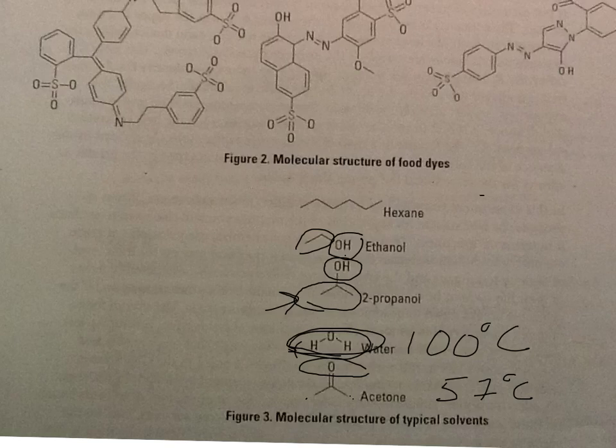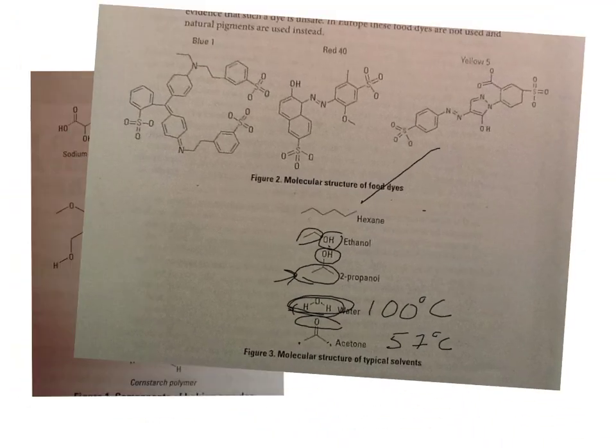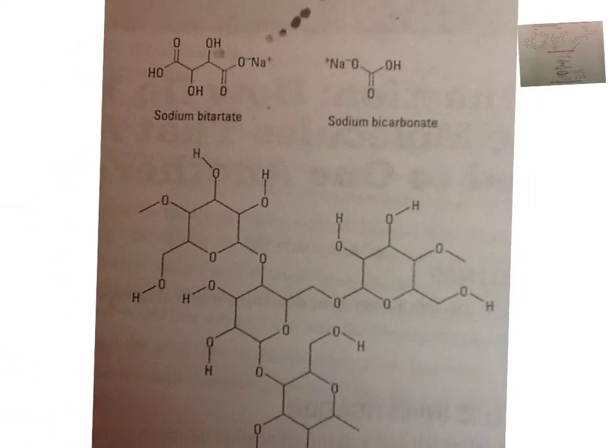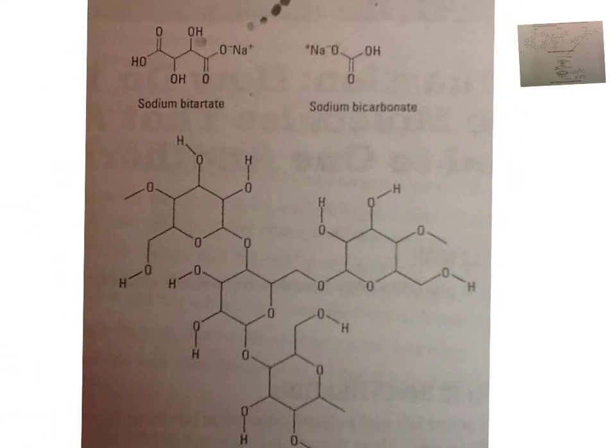Okay. Alright, so keep in mind that these are what these structures look like. And, whoops, let me get the other tool. Okay. So let me move this. Now, these were the structures that were in the pre-lab section, okay? So if you can imagine, water will work with any of these because it's basically like a hydrogen bond. Okay, that's good there. So basically we get this hydrogen bond interaction here. And so I can draw this here, H, O, H, okay? So we'll get an interaction there.